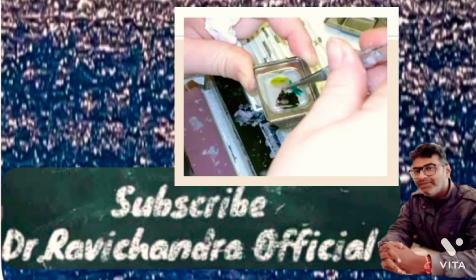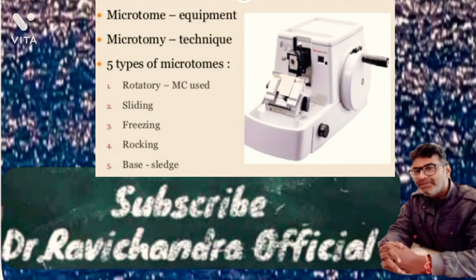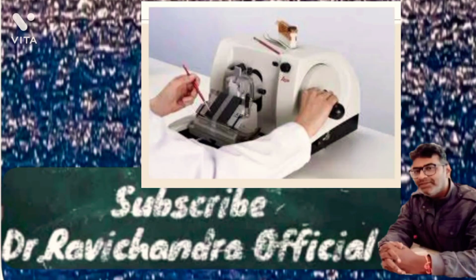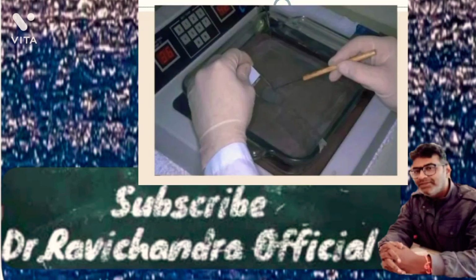Sectioning. The blocks are then chilled in a tray of ice because the cold wax makes a clean cut compared to paraffin wax cut at room temperature. The paraffin block is cut by using a rotary microtome with a 4 to 5 micrometer thickness. In case of frozen section, fixed or unfixed frozen tissue is sliced by using a microtome maintained in a refrigerator device known as a cryostat. Labeling. For indefinite storage of the block, an identification number is written with Indian ink on a small piece of paper and attached to one side of the block.